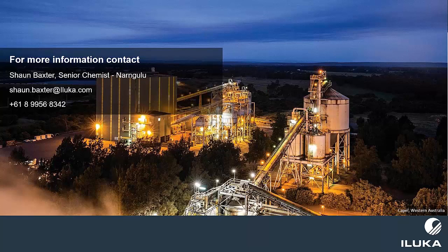Yeah, so we did staged rollouts. The Southwest Lab was the first cab off the rank. It was also slightly complicated with not only new CCLAS, we also had new PCs as well. So for a period of time during the initial rollout, there were complicating factors, and I think they actually duplicated the results in the new system and the old system.